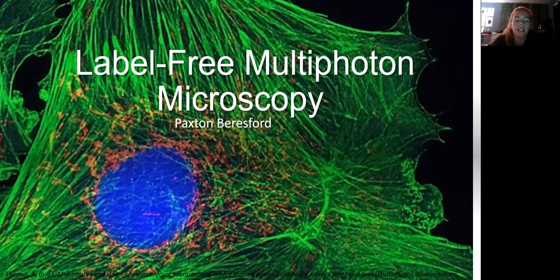Understanding cell metabolism is a concept that is still not entirely understood, but label-free multiphoton microscopy is a non-invasive way of monitoring cell metabolism and lipid production.